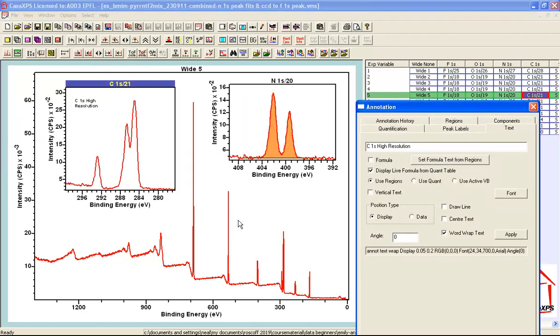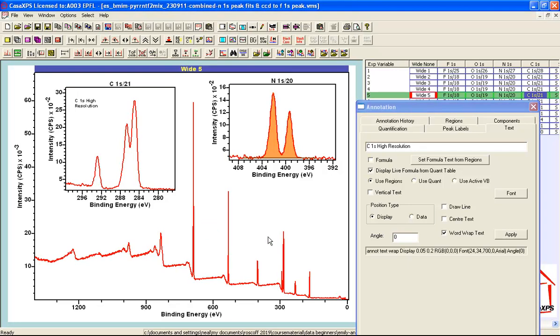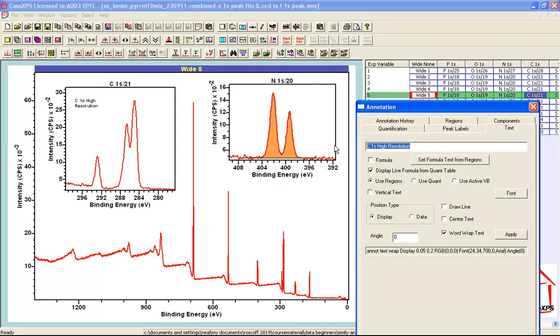If I wish to add text to another one of these VAMAS blocks corresponding to this survey spectrum, what I need to do is give focus to that survey spectrum and then enter a string that will be appropriate for these data. So maybe I want to say the nitrogen 1S peak low resolution. So here's my text.